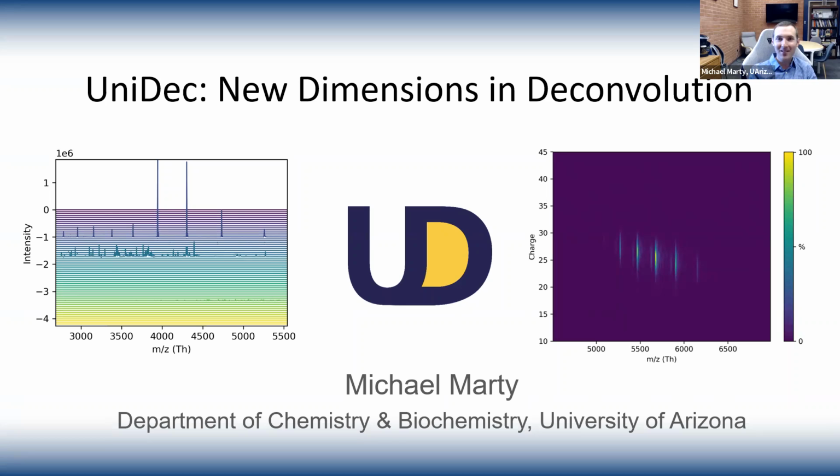Awesome. Thanks, Daniel. It's a lot of fun to be here today. Just to give you an overview, I have about 10 slides prepared. We'll do a quick intro, focusing mostly on how UniDec works and a few of the high level overview features. Then for the rest of the time, Daniel sent some example data, so we'll play with that. We can demo anything you want to see, so we can just go through it.